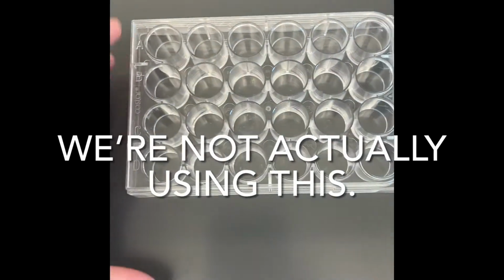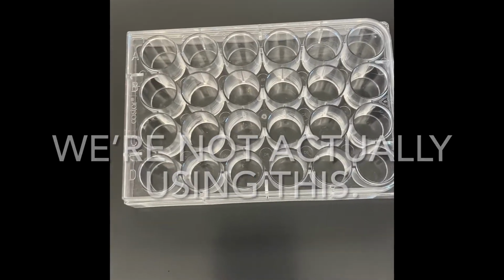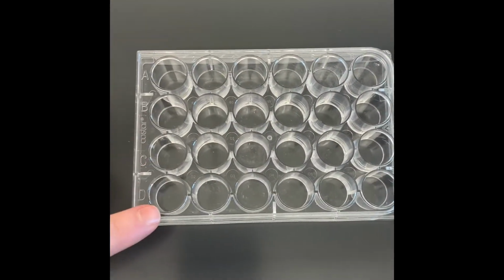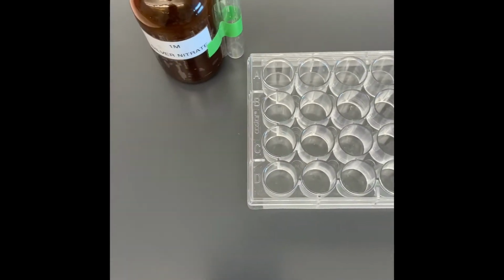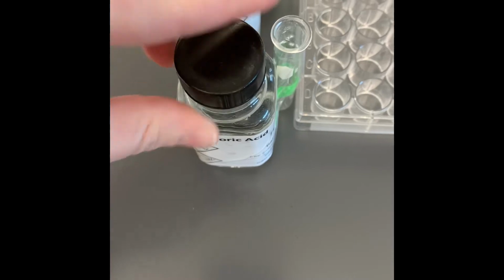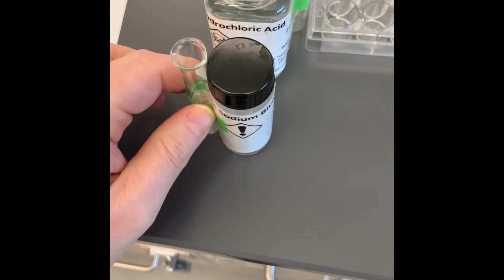Now, taking into account the fact that we can't really mix these solids together too well, we can only mix solids with liquids and liquids with liquids. So going down here, we're going to put our liquid reagents. Reagent is just another word for reactant or chemical.